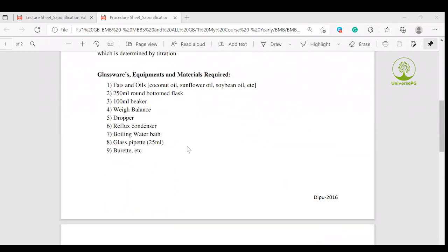Now let's look at the glassware, equipment, and materials used. For oil and fat samples, we used coconut oil, mustard oil, soybean oil, and animal fat.